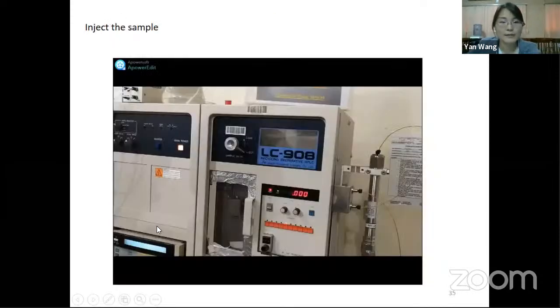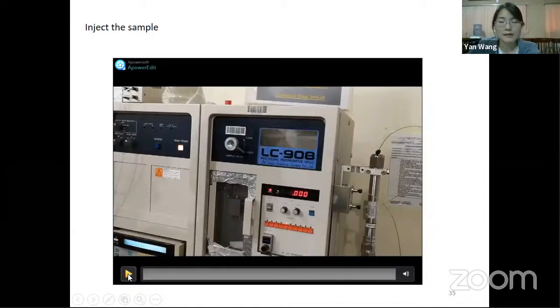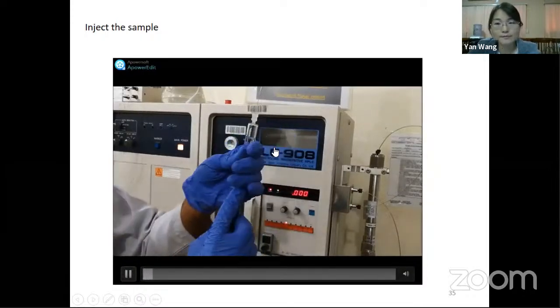Here we are going to inject. We have already filtered and I will show you the loop. And of course the loop is separate. I'm not going to take the loop out from this machine. It's a separate loop, just to show you how it looks. And here we are going to inject the sample.